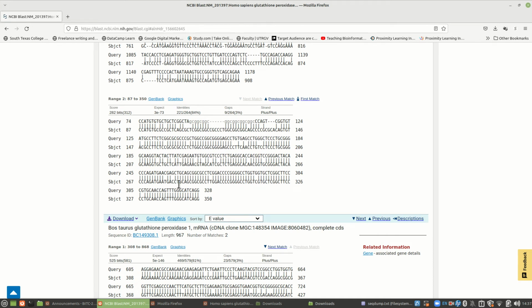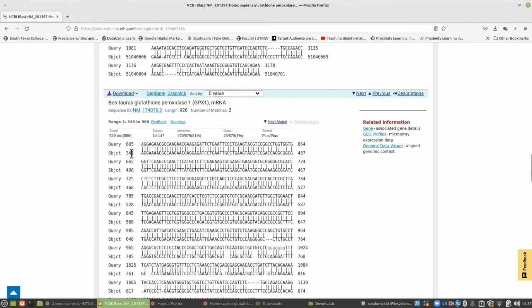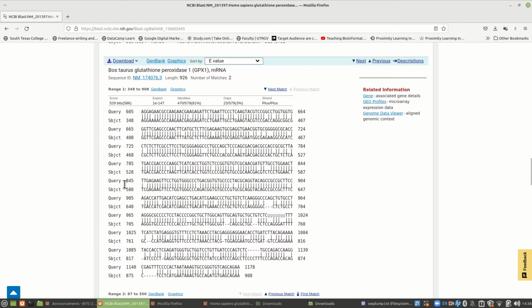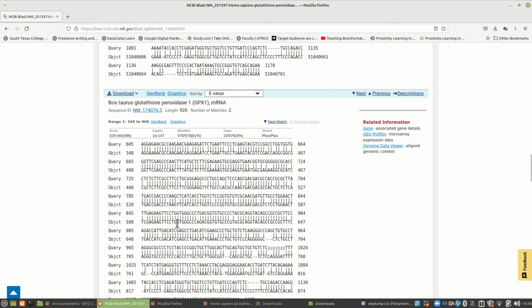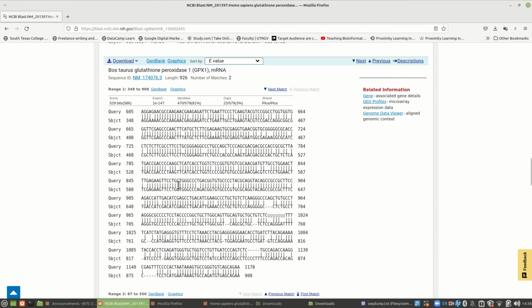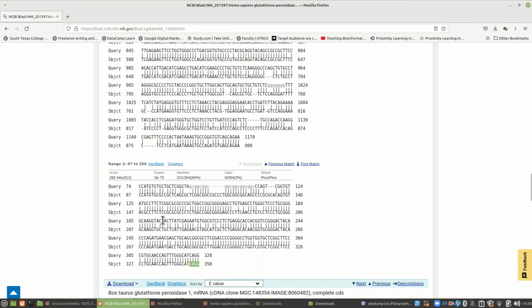So what you need to do is compare these, figure out what's going on. The subject here is 348, and it aligns with right in here, GG. Let's see, is that a GG? Two GGs. Yep, right there. A before it. Yep. So this AGG right here is this AGG right here, and this AGG here is up here, and that one. Okay. So this is telling you that this is actually very interesting.